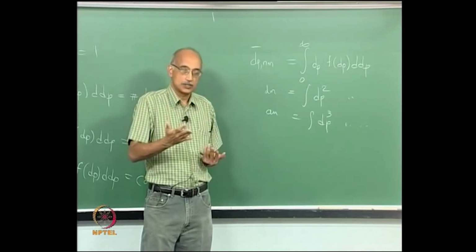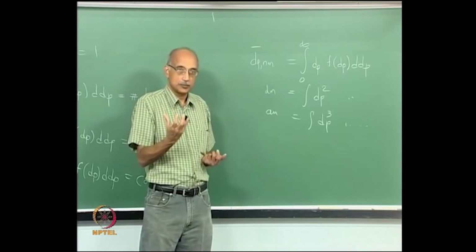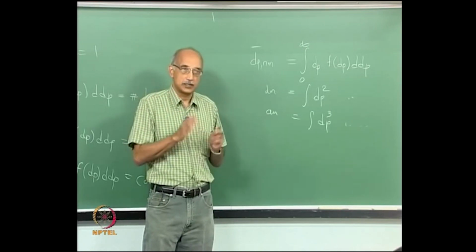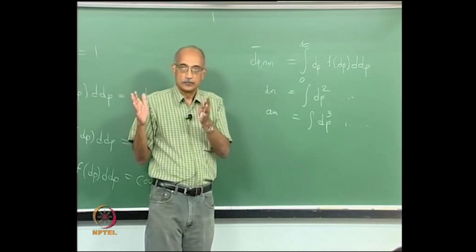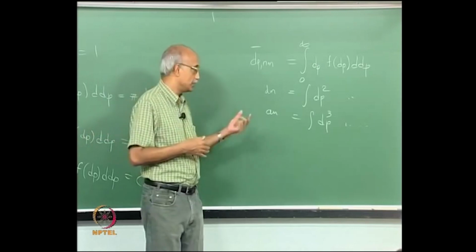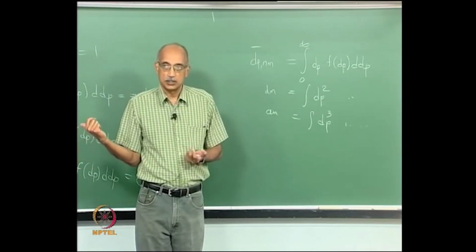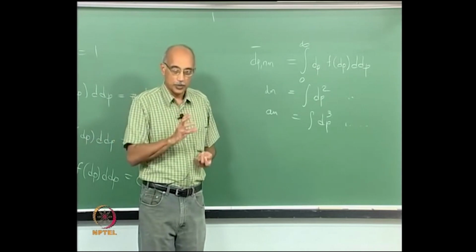You obtain a characteristic of the material that you are looking at, but it is very difficult to interpret the spectrum as such. What you do is you compare it to a reference spectrum in a library, and then you identify that this material has a signature that is closest to this reference material in my library, so it must be that material. Similarly, when you obtain particle size distributions, as far as possible try to refer back to the standard size distributions and assign a distribution to a particular population of particles.